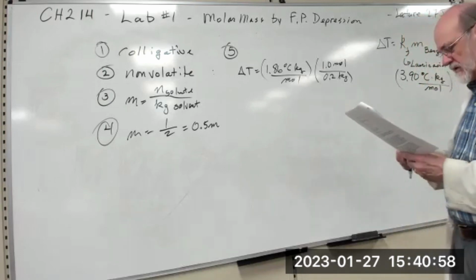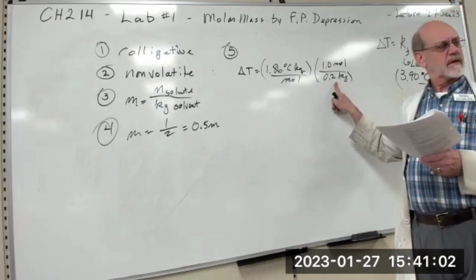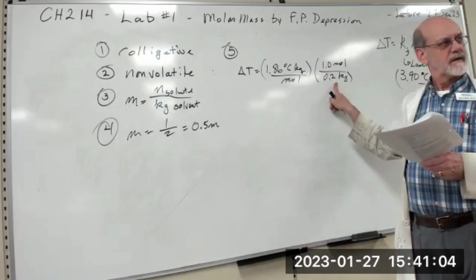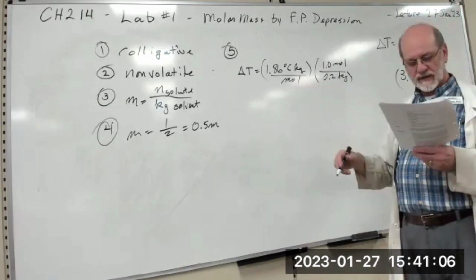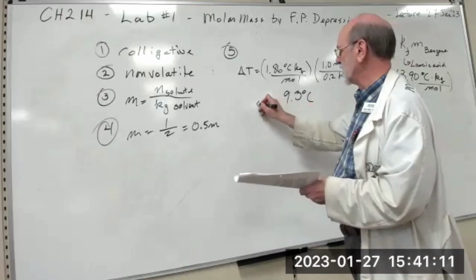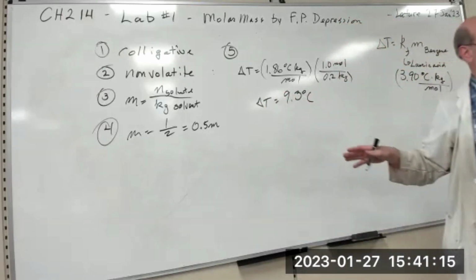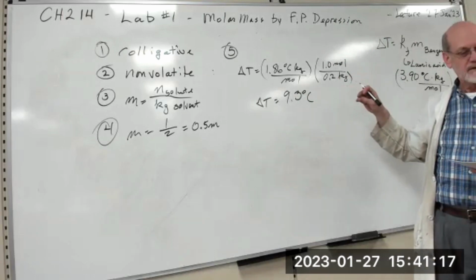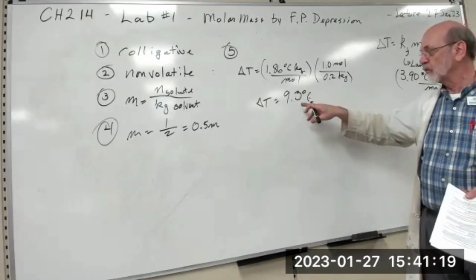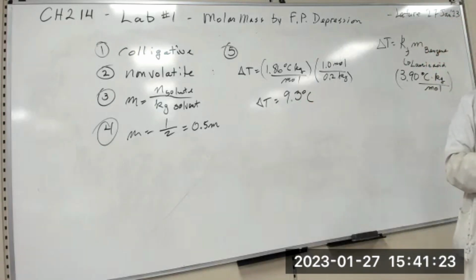Yeah, freezing point depression. So this is 0.2 into 1 is 5, isn't it? So 5 times 1.86, which should be 9.3 degrees C, is the freezing point depression. So whatever the freezing point is, we're not told that, it will be depressed by 9.3 degrees Celsius. Okay.